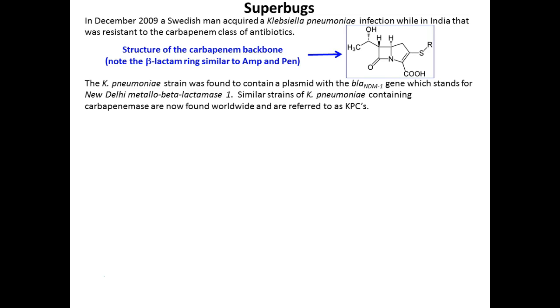And this is a circular piece of DNA in addition to their chromosome. That's what we're going to be working with today. We're going to be working with a plasmid, a circular piece of DNA that we're going to transform our bacteria with. They're going to pick up that whole circle, well, it's not big, but a relatively small circle of DNA, which is information.